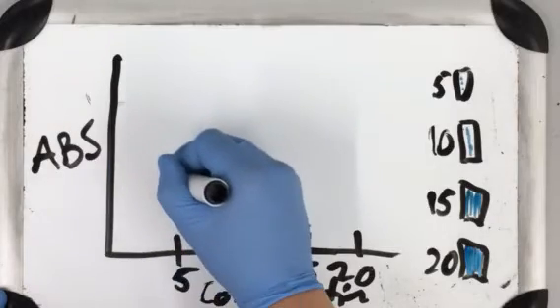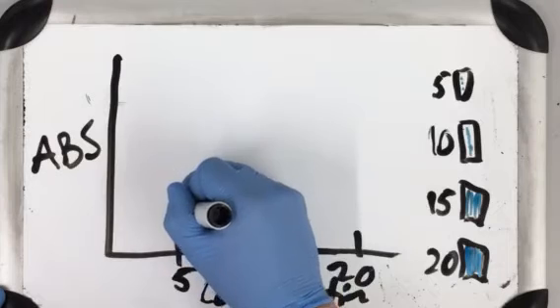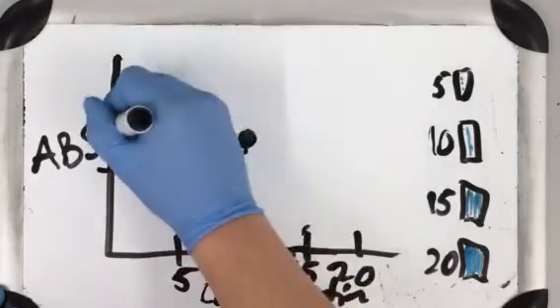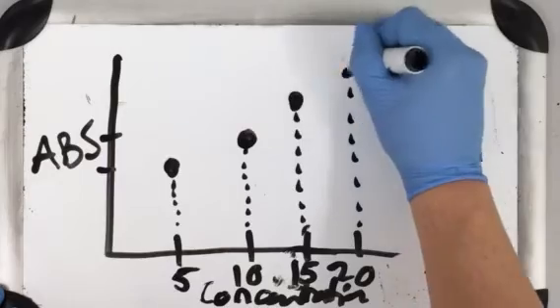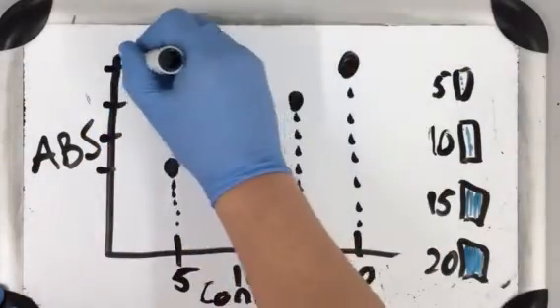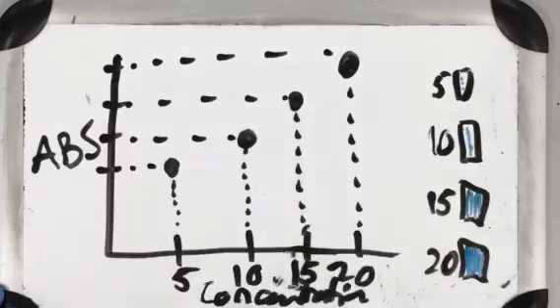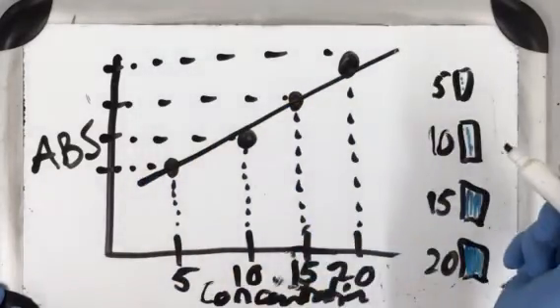So when we do absorbances, we know we're at 5 concentration because we're measuring this first one. First one's here. Here, higher absorbance. Three, 4, and these were the values that you found. And they correspond to given concentrations because we know the concentration, and right now we're making the standard curve. It's not really a curve, but it helps to visualize it.